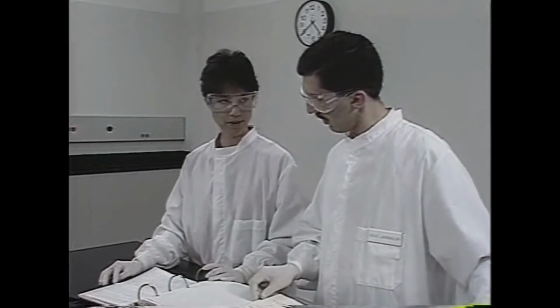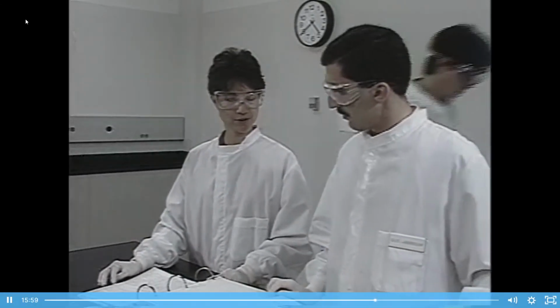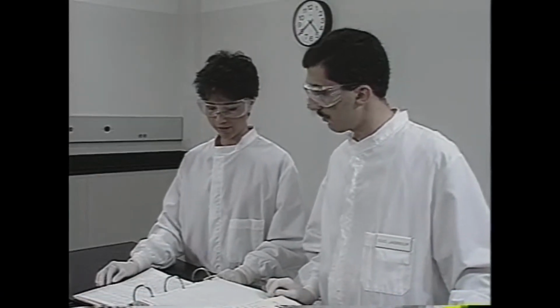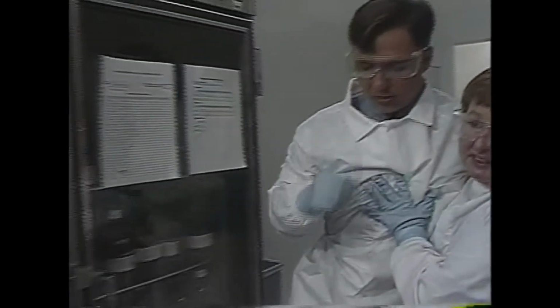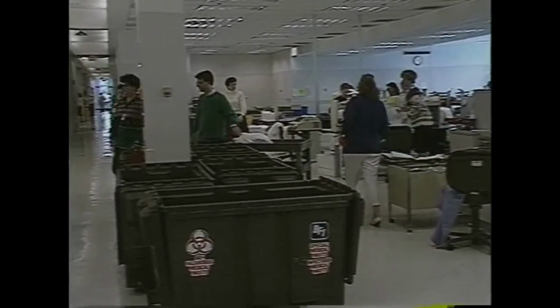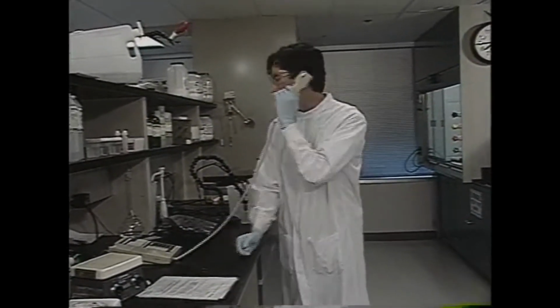By definition, accidents always take us by surprise, so we need to be prepared to deal with emergencies before they happen. Consult the MSDS or your chemical hygiene plan before you start to work with a chemical or a process. If there is a leak or spill of a hazardous chemical, quickly evaluate the situation. First, attend to anyone who is injured. If other people are in danger, evacuate the area immediately.